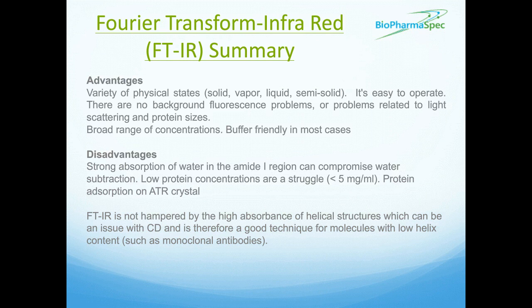As with all things, there are certain disadvantages as well. Water in solution has a strong absorption in the amide 1 region, which can compromise some of the techniques and the subtractions you're trying to do. Also, low protein concentrations, less than 5 mg per ml, can be quite difficult in transmission because of the technique.